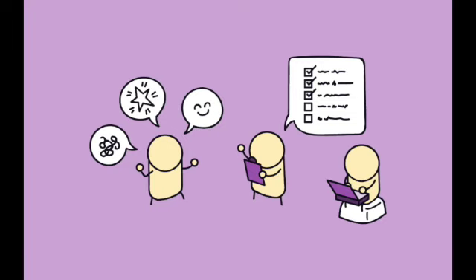Some qualitative observations that I made were that when the worm moved, it expanded and moved in a long striding fashion, kind of like in a domino effect where the top moved first and then the movement traveled through the whole body. And then I also observed that the worm would move a couple of centimeters and then stop for a period, and then move again, and then stop, and then move again and then stop throughout the 20 minutes.